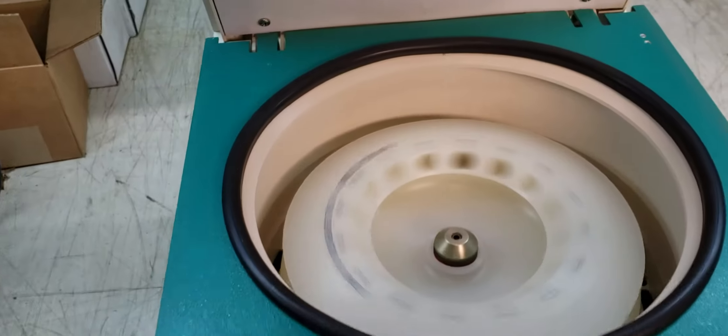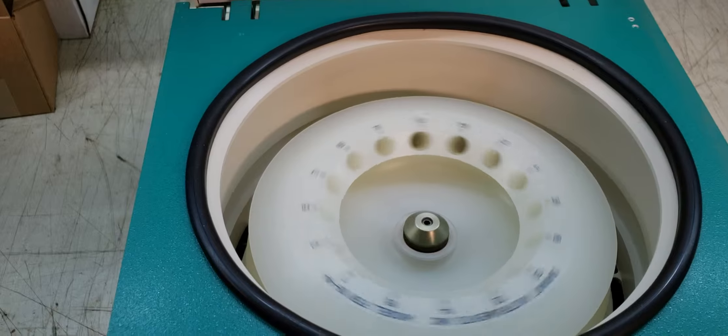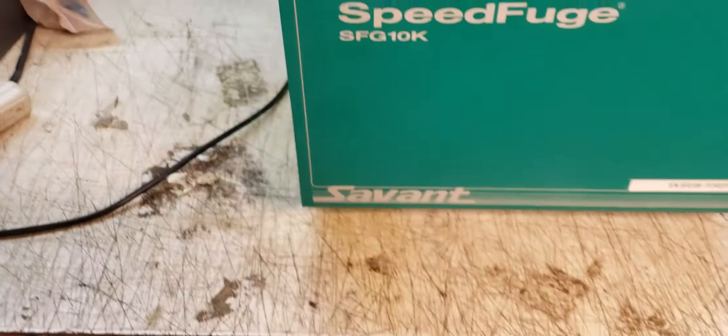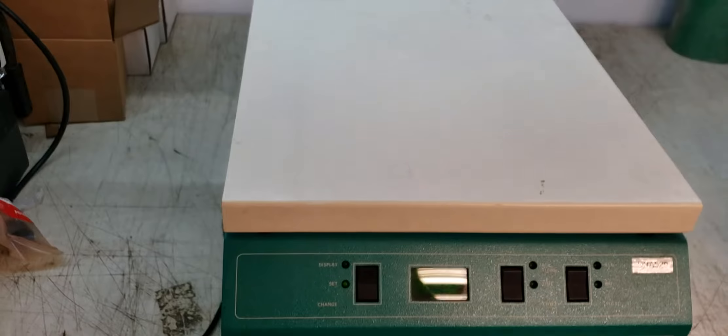Oh, there it goes. I just wanted to see if we're still spinning — yeah, there it goes. But that's the unit. We do have three of these, they're all identical. If you've got any questions, let me know. Thank you.